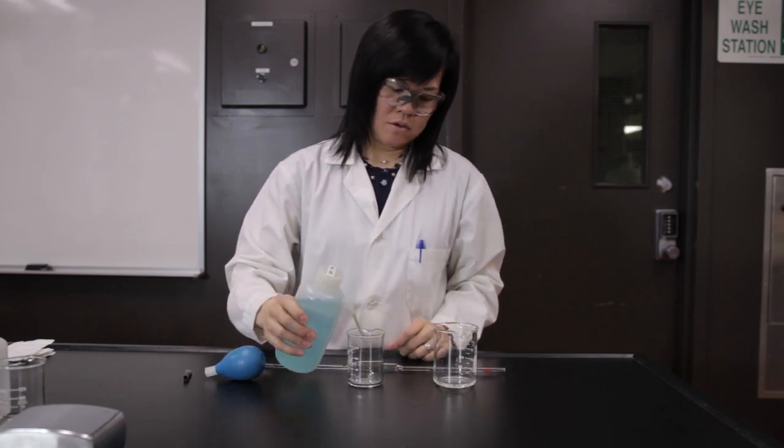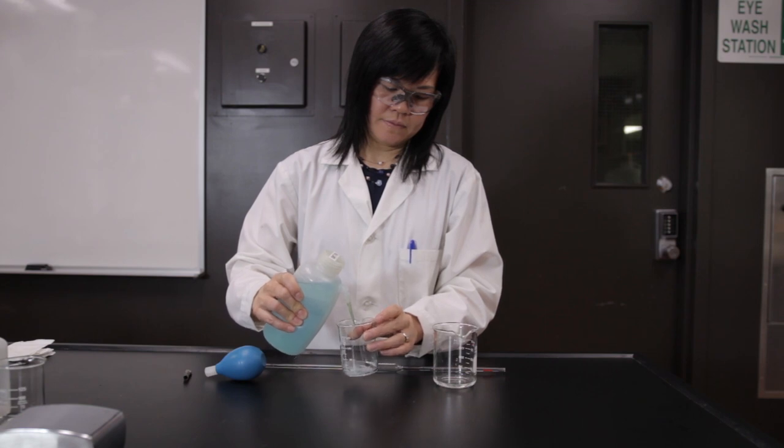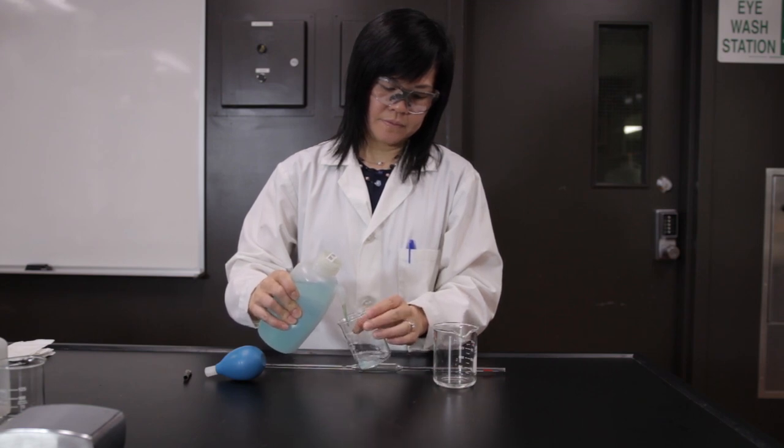Add a sufficient amount of unknown copper ion solution into a clean, dry, small beaker and rinse the pipette two times.